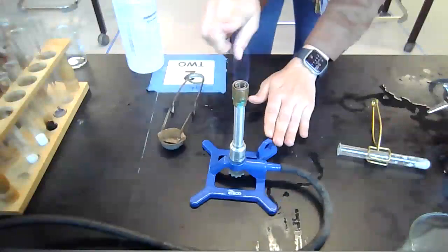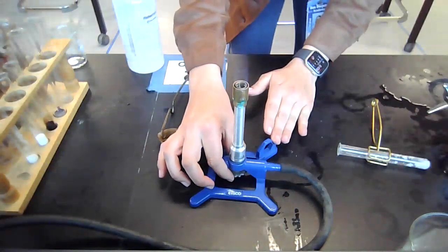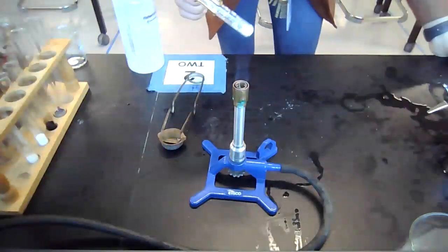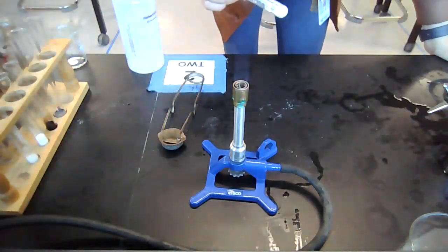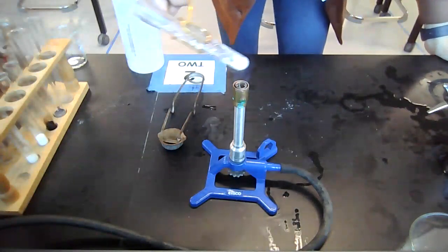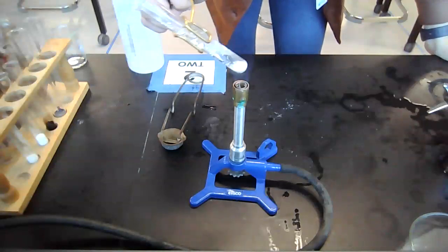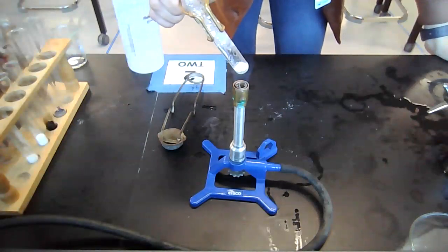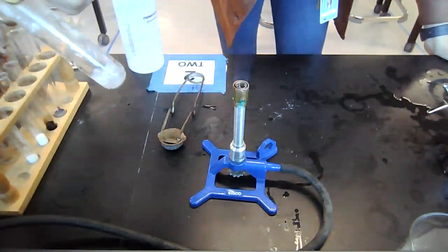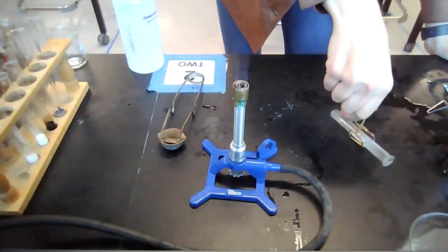I have my Bunsen burner. Flame's a little high, so I'm going to lower it to a nice low blue flame. And I just want to time when it's going to melt, when it starts to turn from a solid to a liquid. Right now I'm starting at 455. I'm going to swirl and point it away from me. All right, and now, if you can tell, it is already melted at 5. There's already a liquid in there. That's our first one. I'm just going to set this to the side.